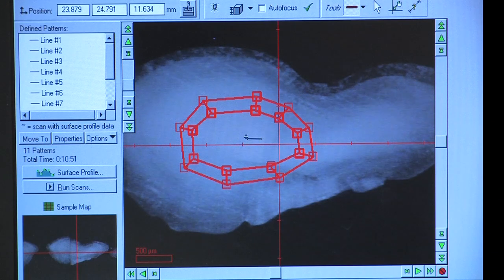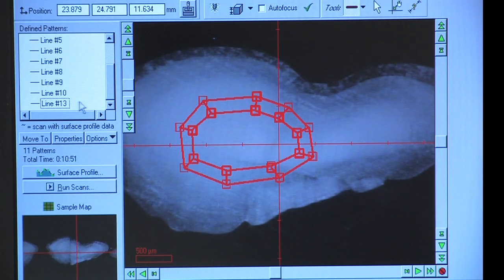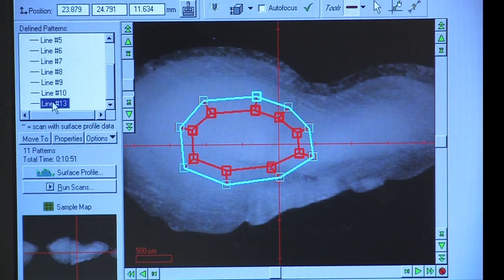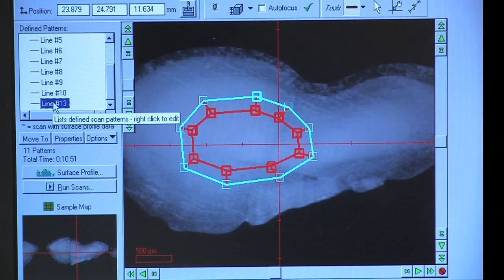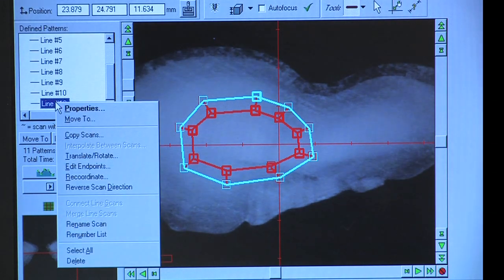Before you begin milling the sample, you will have to adjust a few drill settings in the properties. Select the line you want to drill in the Define Patterns window on the left side of the screen. Right click on the line of the Define Patterns box and choose Properties.